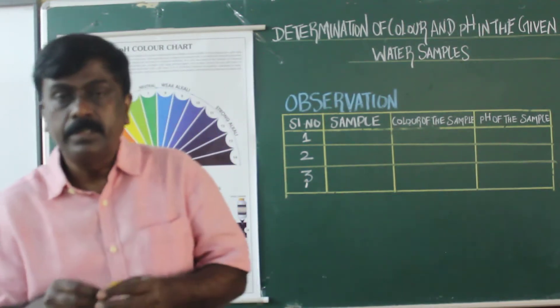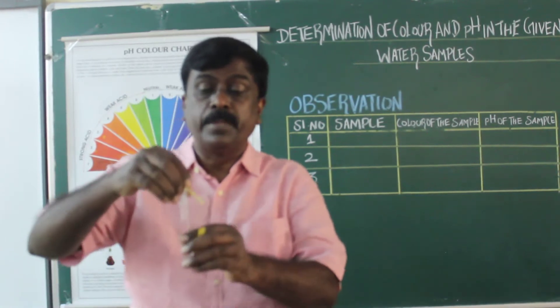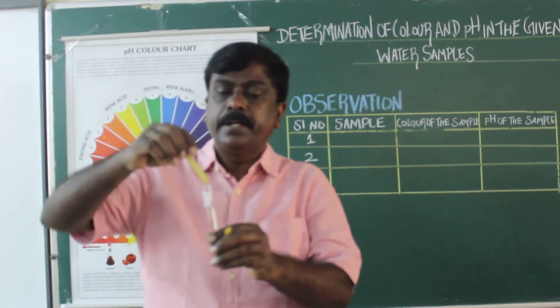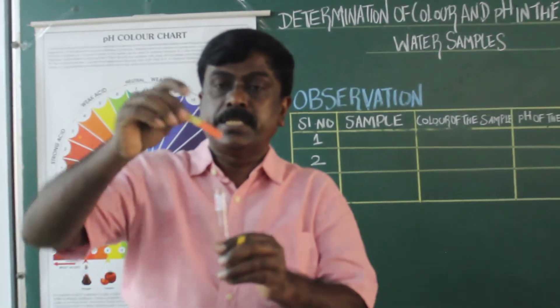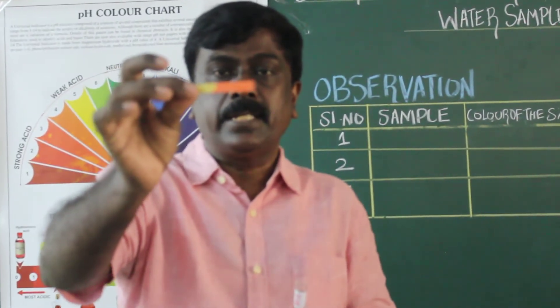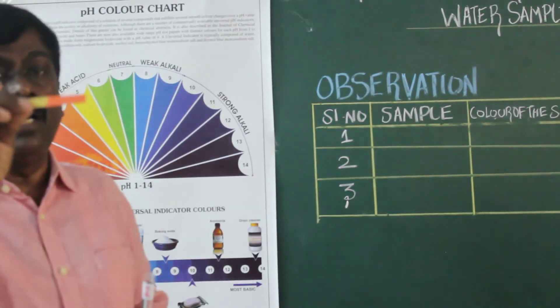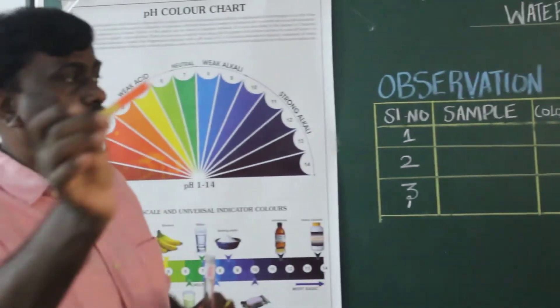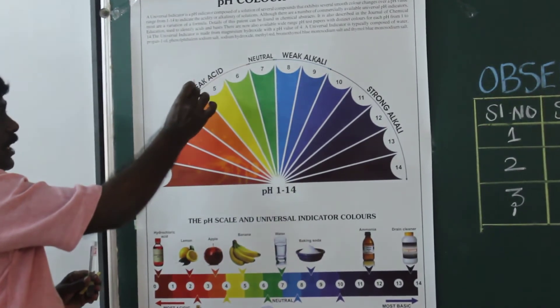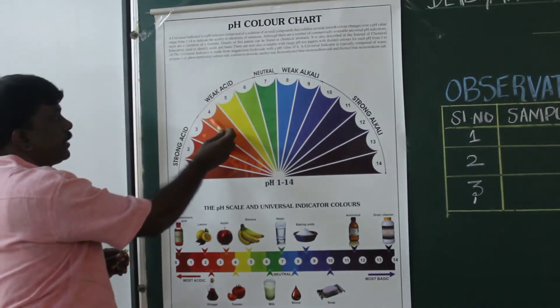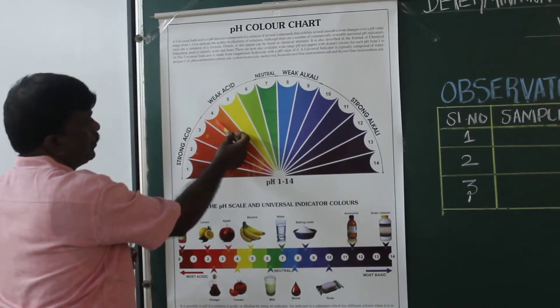Next, take the pH paper and first take the test tube from letter 1 and dip that paper. You can see a color change which shows the orange color. Now take this pH paper and compare it with the pH color chart — it comes nearly to pH 4.